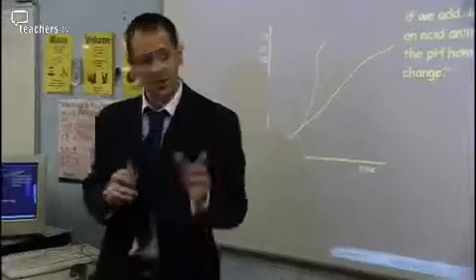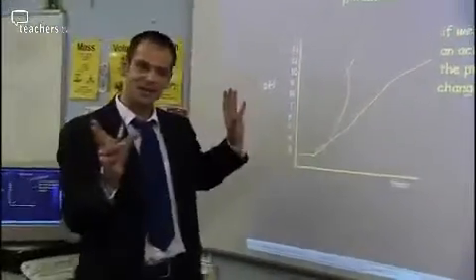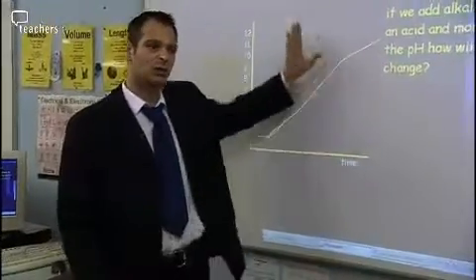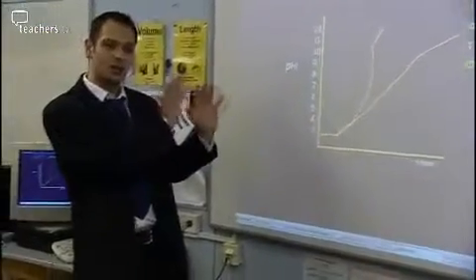Well, I'll tell you what. It's not a bad idea. I quite like the idea. But the main thing is, what we're seeing here is that the pH goes up, we go past neutral, and I like the idea, and you're thinking maybe we're going to go faster than what Caroline says. Okay? Right, let's have a go then.